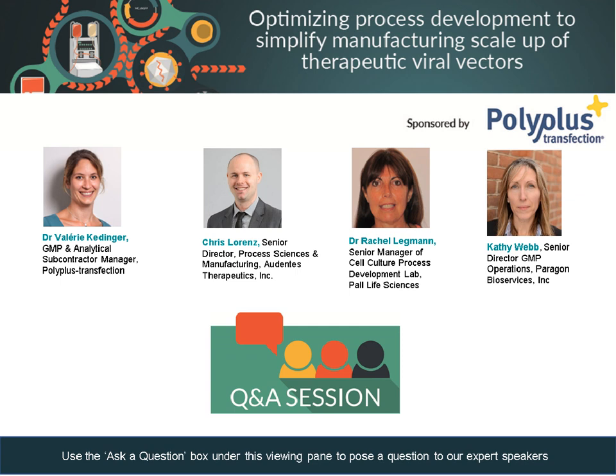So that's a long, fairly arduous process to obviously run your experiments and send it out for this analysis. There can be quite a bit of turnaround time, and sometimes you want to move with your development a little bit more quickly than a metabolomic type exercise allows you. But I think there's more opportunity to explore that a bit further. Absolutely. Fantastic. Thank you.